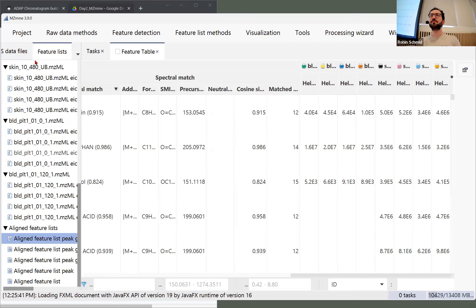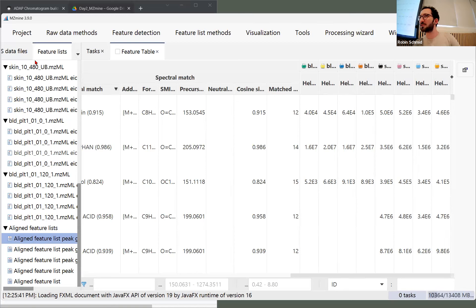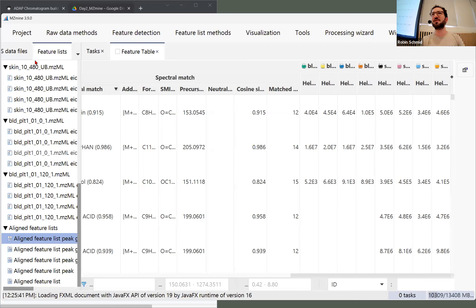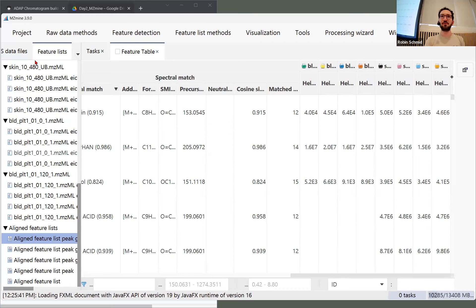There are different alignment algorithms — for the join aligner you don't have to specify any reference sample, but there were some other algorithms for GC or RANSAC that might require that.